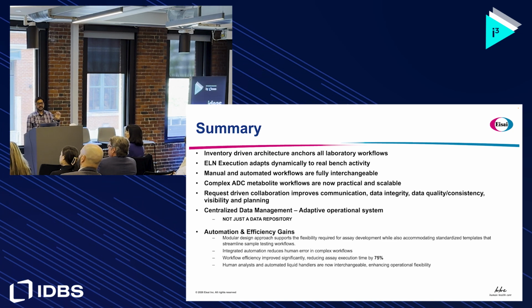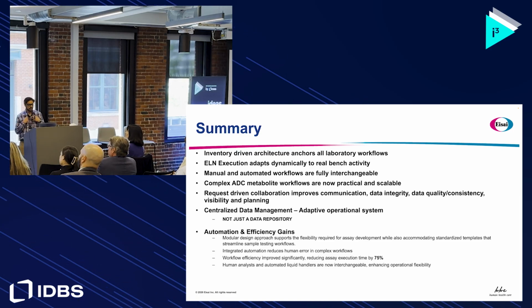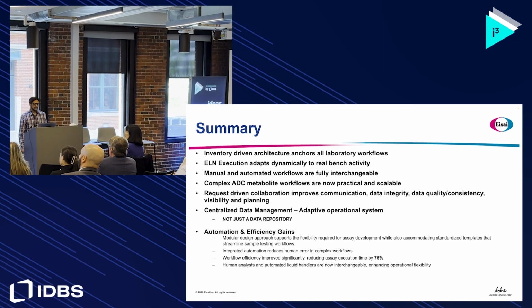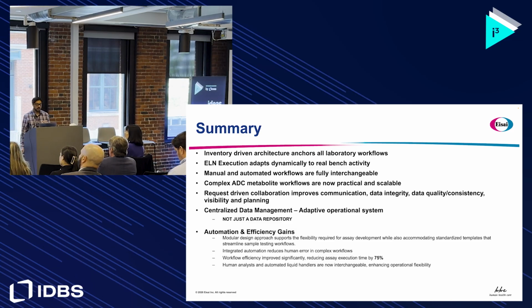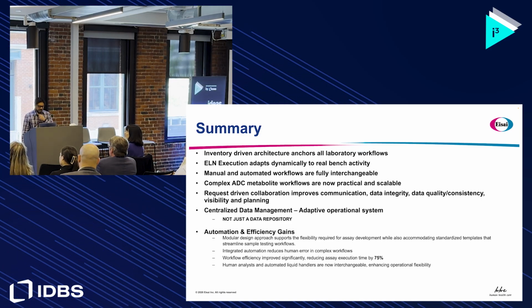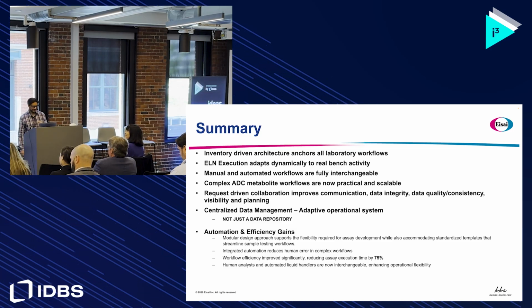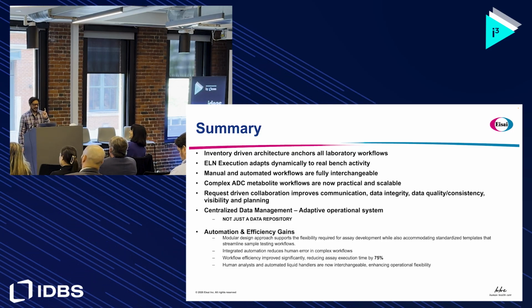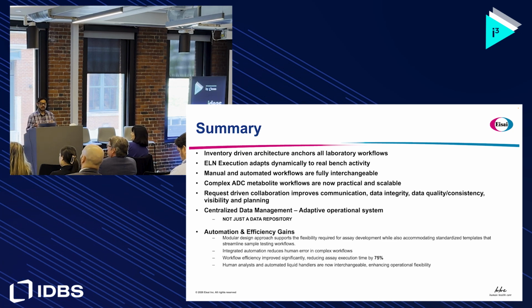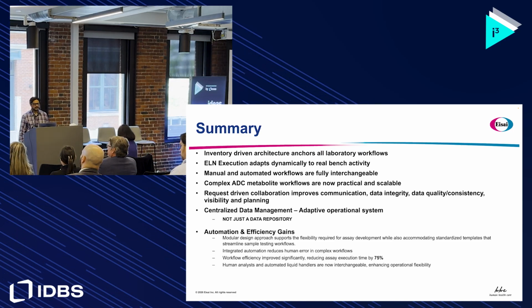We have workflows that you can do manually or automated. The workflows don't dictate your work. We dictate the workflow to the templates, right? It really gives us a lot of flexibility when we're in the lab, and we're not rigid anymore. I showed you the metabolite stuff. I love that stuff, so you're going to have to hear me talk about it every time I give a presentation, probably. And I can show you how we tie automation into this. The automation thing is a godsend for me. So thank you. I did it.